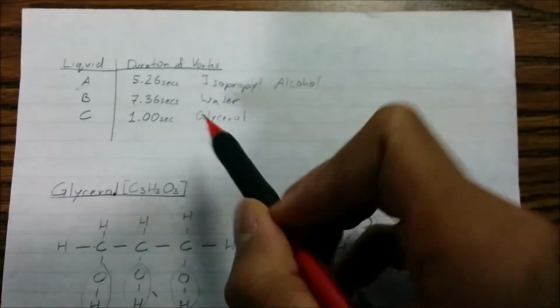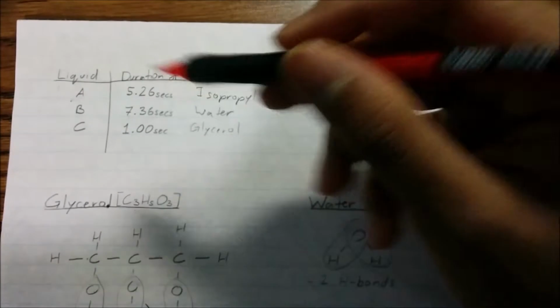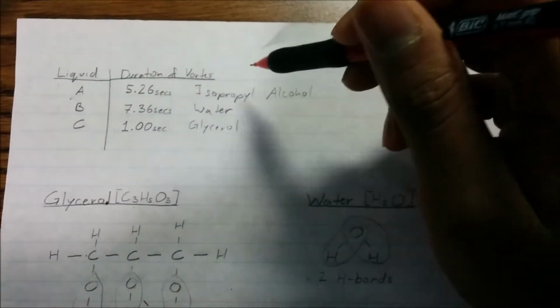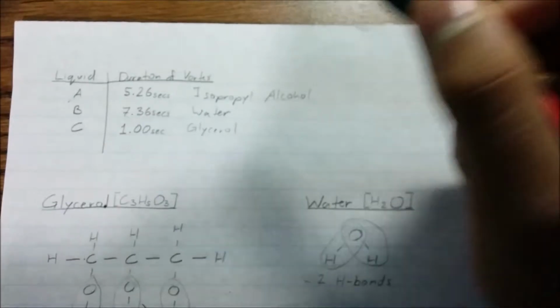Again, because glycerol's intermolecular forces could not be broken by the swirling motion, but since water could, and so could isopropyl alcohol, water would have the longest duration, while isopropyl alcohol would have the second longest.